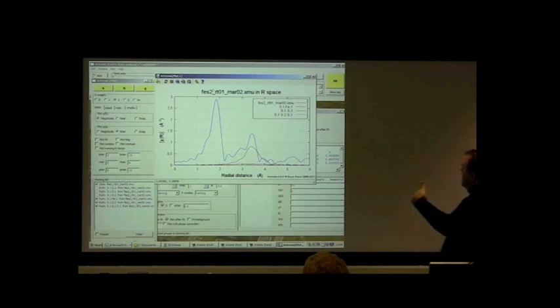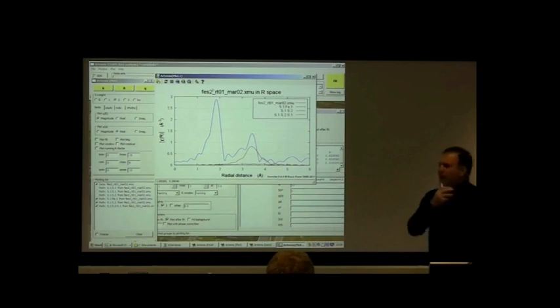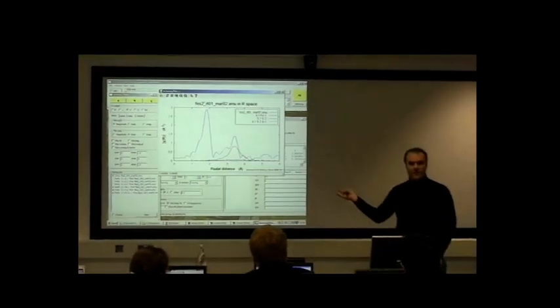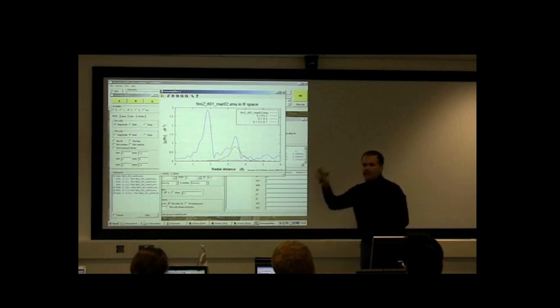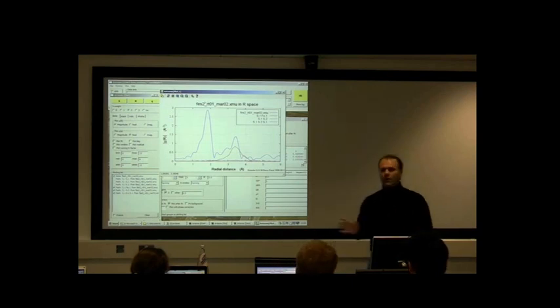Thing 2, I've already forgotten what my list of 3 things to talk about were. So it's not a radial distribution function. Oh, thing 2. Thing 2 is that we haven't done any work yet, right? We haven't actually talked about how to do a fit, and we certainly haven't fit any data. All we've done so far is plot data and plot the contributions from paths. This is how I always start a new data analysis project.